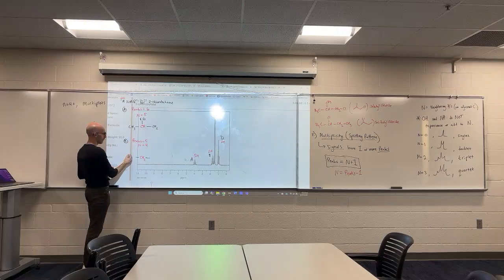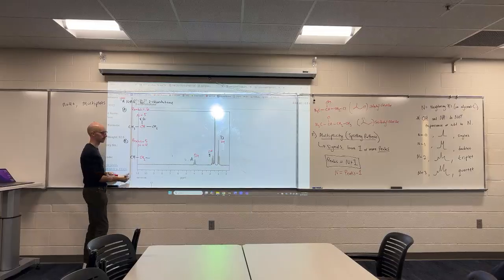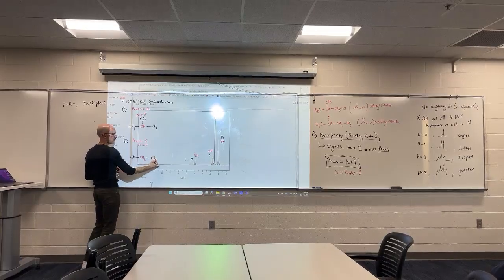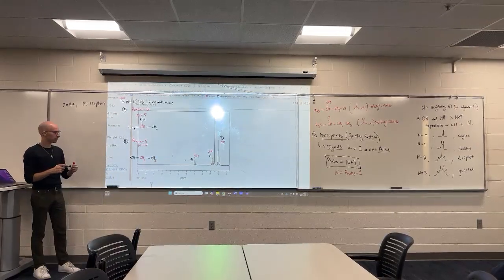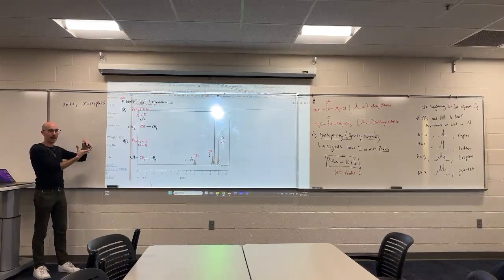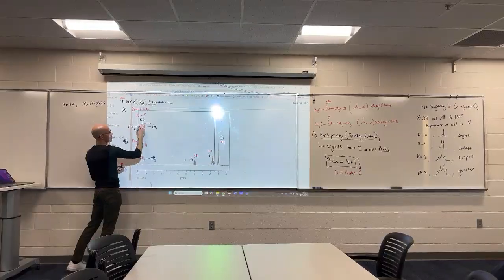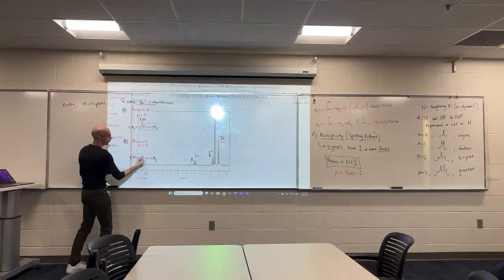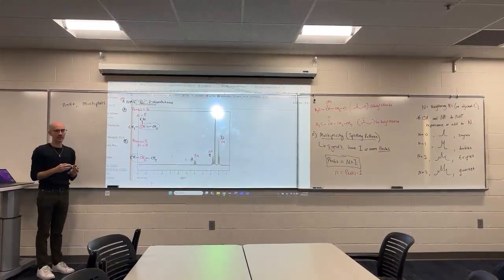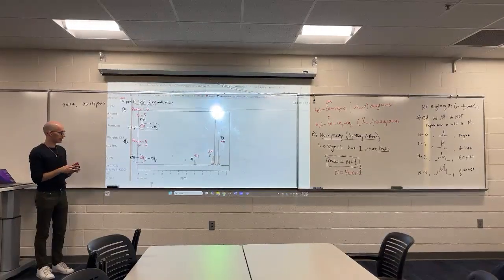So one of my neighbors is a CH. How do I get the other 3? A CH3. I'm starting to get pieces of my molecule, and right now, these 2 pieces overlap with each other. I've actually built my whole molecule, but I can prove the rest of it.